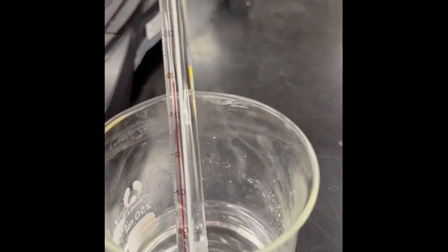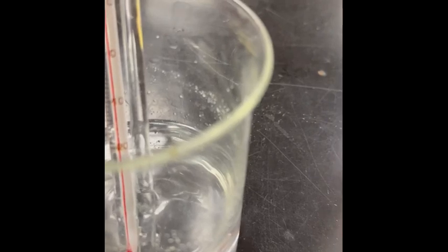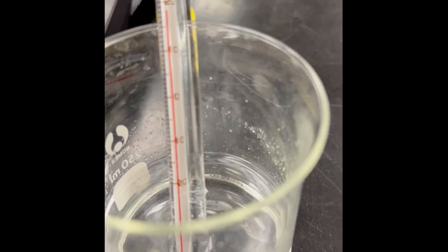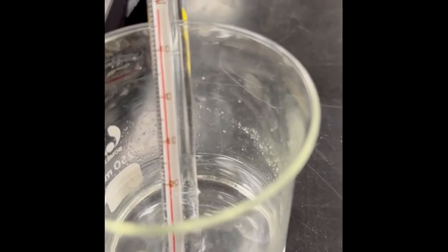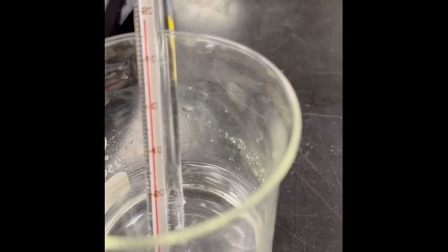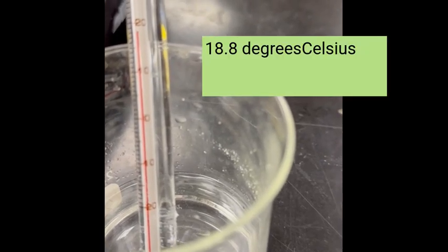What I'm going to do is make note of the temperature of this water, because that's the temperature at which the gas was being created. It looks like we are at a temperature reading of just under 19 degrees, and it's not 18. We always estimate that last digit, so I would say it's fair to say around 18.8 degrees.